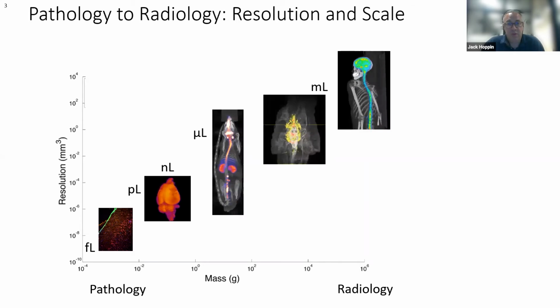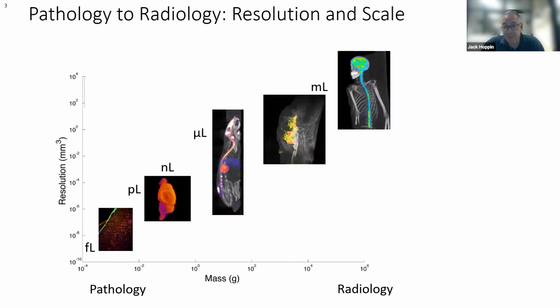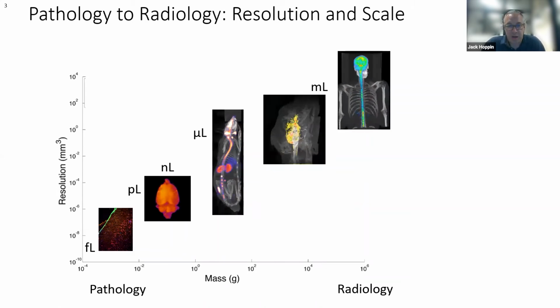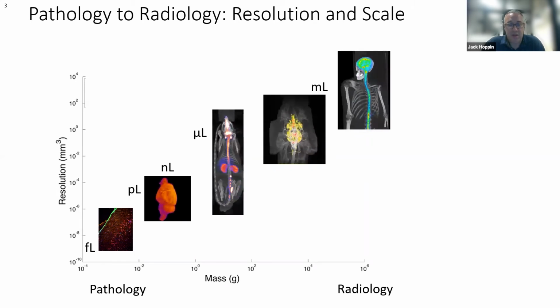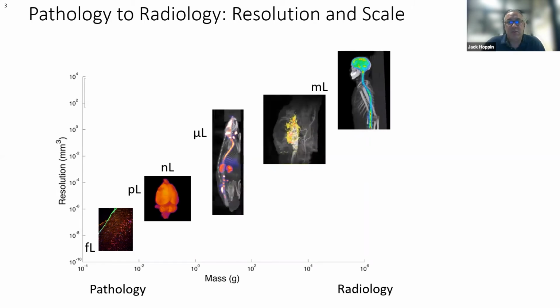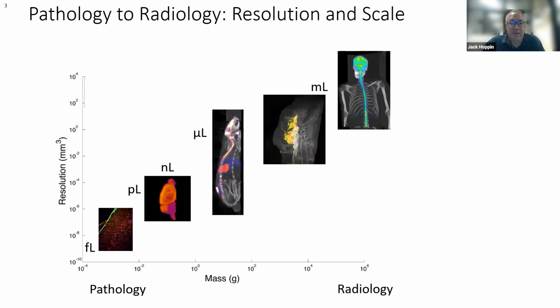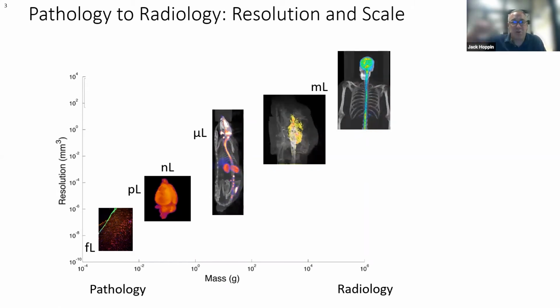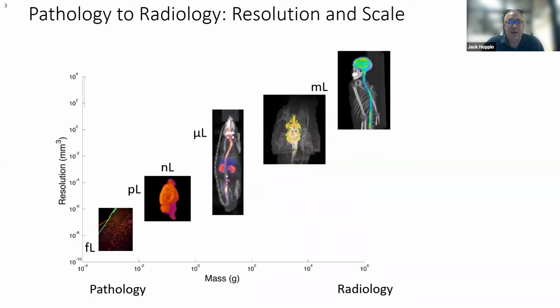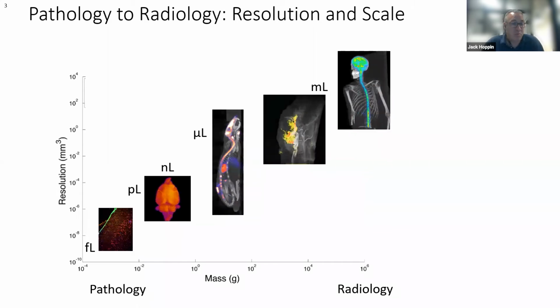It's been a huge help and guide to do in vivo studies of pharmacokinetics of drugs, of pharmacodynamics of drugs, to look at all sorts of biology and pharmacology and chemistry in that space. Next to it is an image from this modality, which in this case is the fluorescent labeled antisense oligonucleotide. It's a nice three orders of magnitude volumetric look. We're a milliliter sport in humans, a microliter sport in rodents. The technology I will talk about is a nanoliter sport, and we were under a microscope.